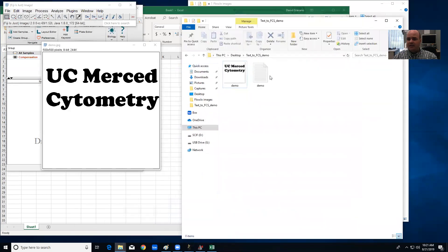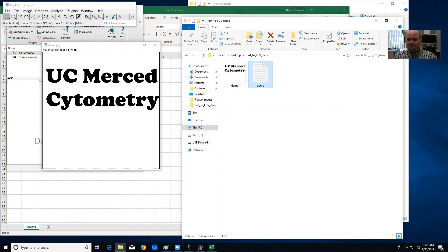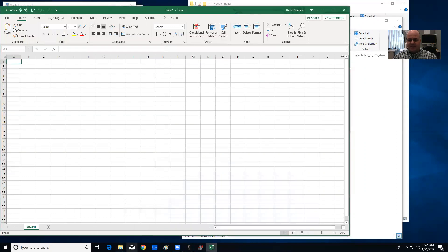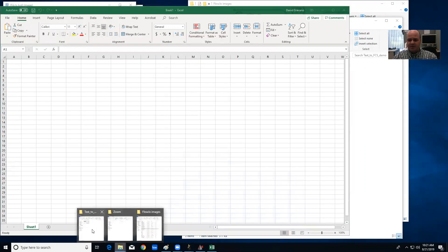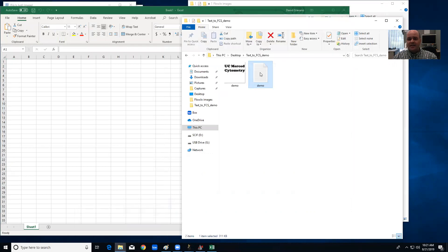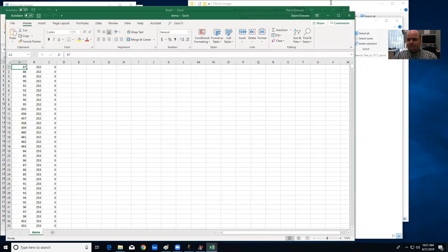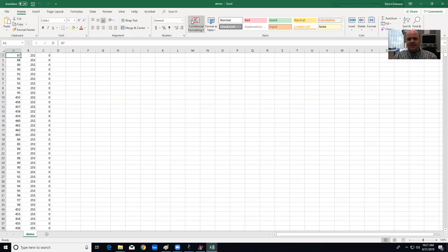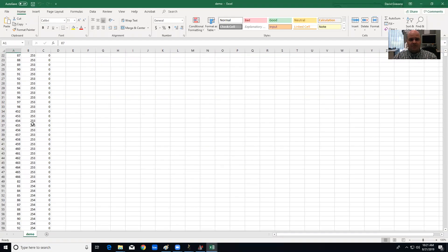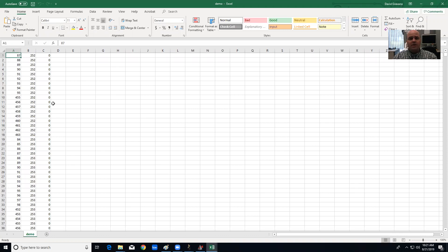Now I'm going to go into my folder where I have this text file, and the next step is I'm going to drag that text file into Excel.